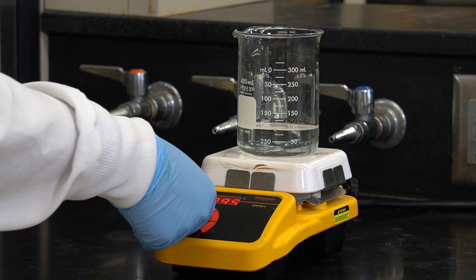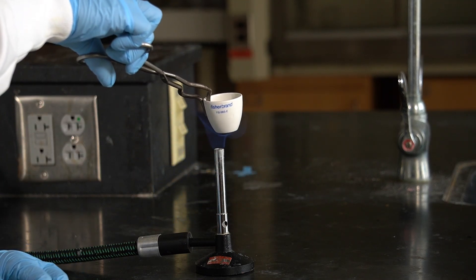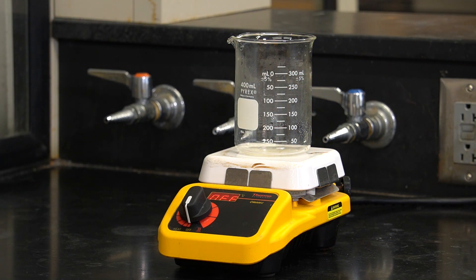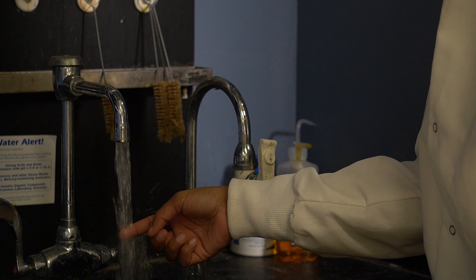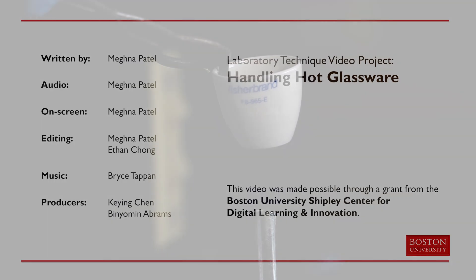Handling hot glassware safely is one of the key aspects of a safe lab experience. If you accidentally break a piece, review how to handle and dispose of glass waste properly. Lastly, if you accidentally burn yourself during the experiment, stay calm and quickly cool the burned area with running water for at least 15 minutes. Your lab instructor will then help you get in touch with professional medical services. By following these best practices, everyone can enjoy a safe and fun time in the lab.